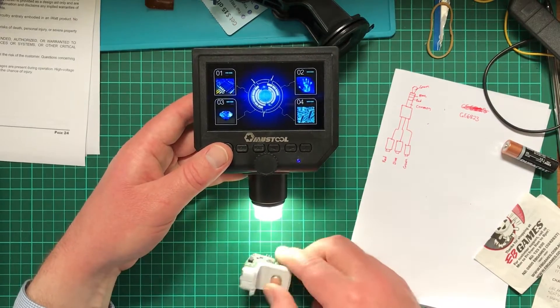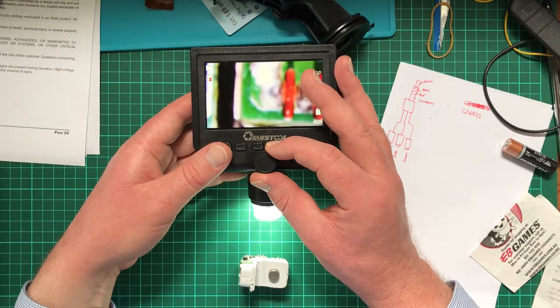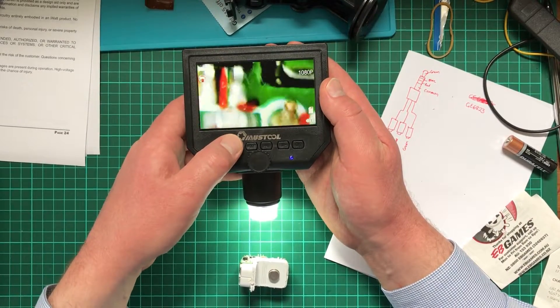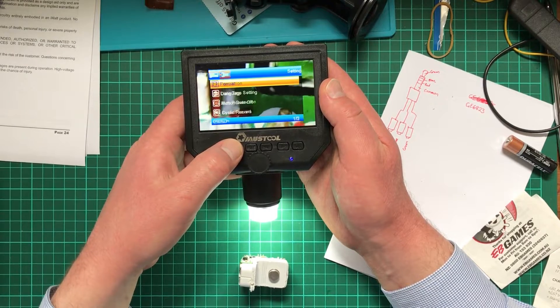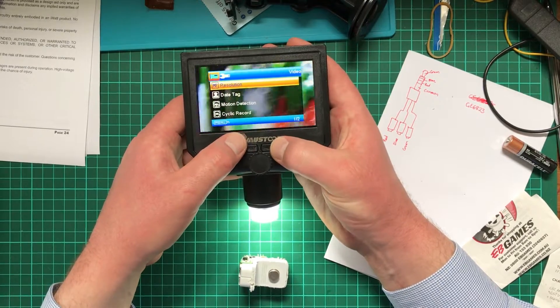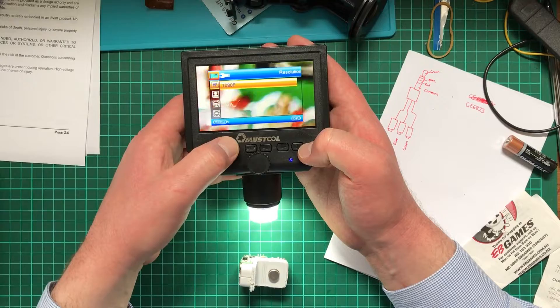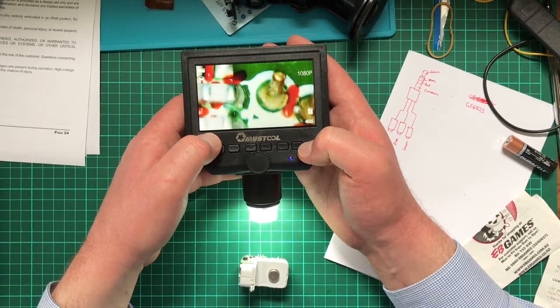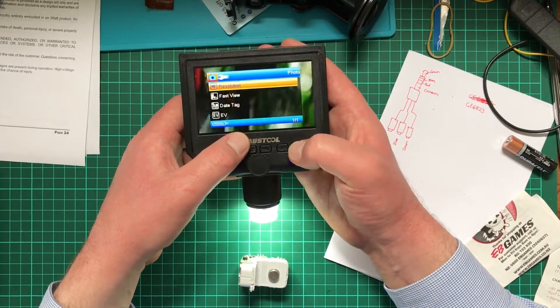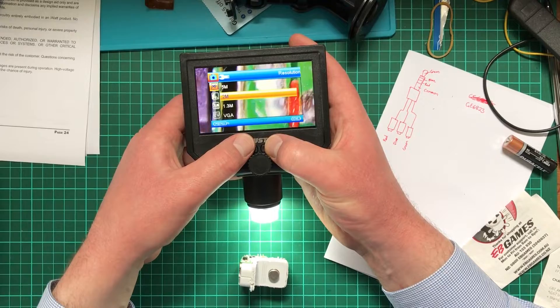Just fire this up. Now, focusing on this is generally okay. To change the mode — as you can see, I've got it set to 1080p. And when I hit the mode button, it comes up default as 2 megapixels. It's a little low. That might explain why the photos are coming out the way they were.